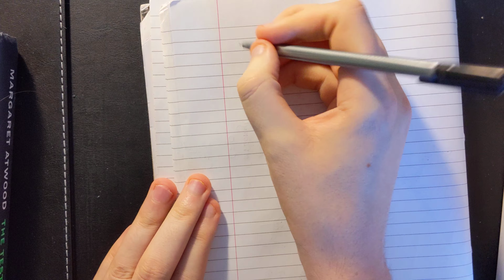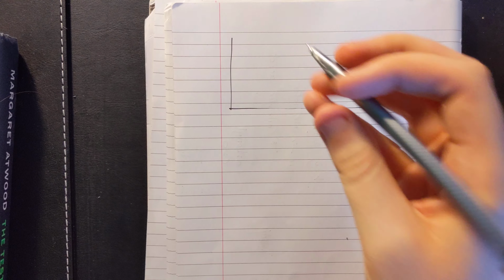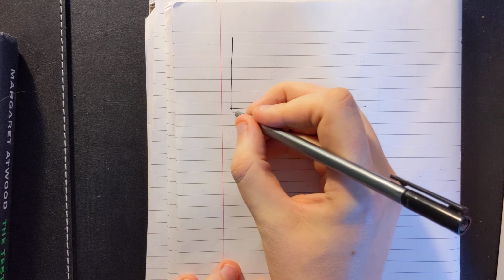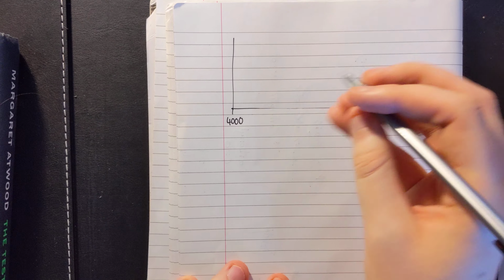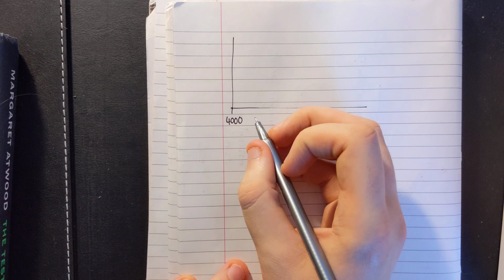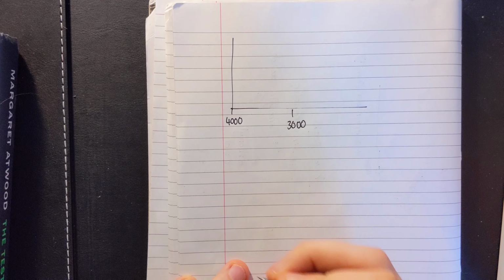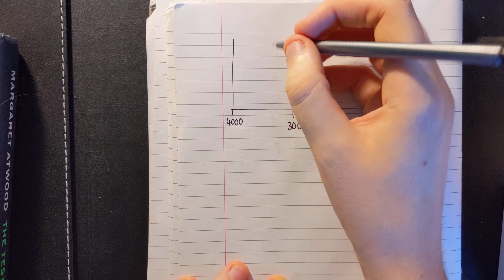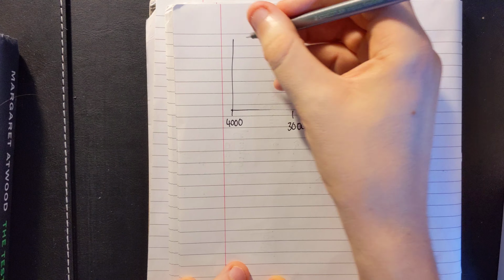So the only other peak that you might see is the NH2. Now, just drawing out a rough sketch. The NH2 peak usually comes in roughly, I think, I don't have the data table with me, but it's generally at quite a high absorbance, so up past generally where the alcohol is. So if I draw just the far left hand side of the graph, alcohol might come in around here. I think it's around 3,700.